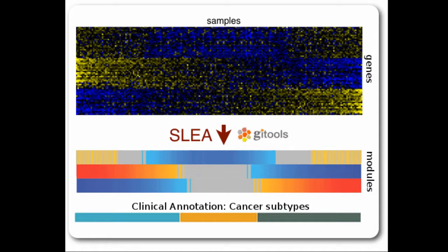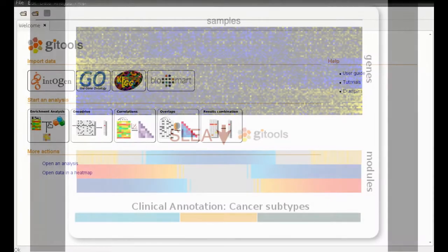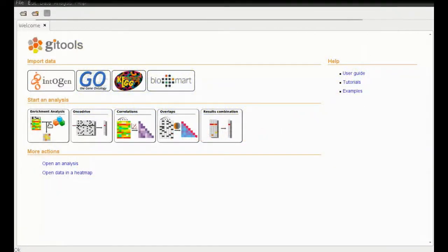In this tutorial, we will perform SLEA with our glioblastoma expression data for five KEGG pathways stored in the .gmt file. First of all, we need an open instance of GI tools. Download version 1.6.2 or later at www.gitools.org.